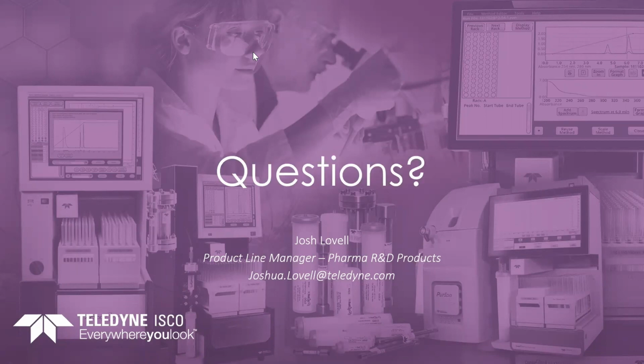And that's why it's so important, if you're doing multiple separations of the same or similar compounds, to determine a method optimization that works well for that class of compounds or that specific compound that you're going to reuse multiple times when you scale up. And the time savings are going to multiply with each injection that you do.